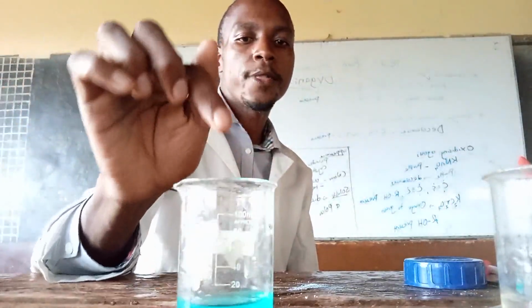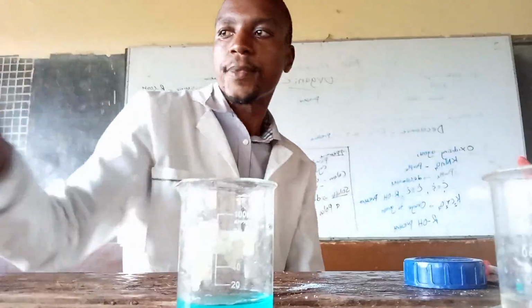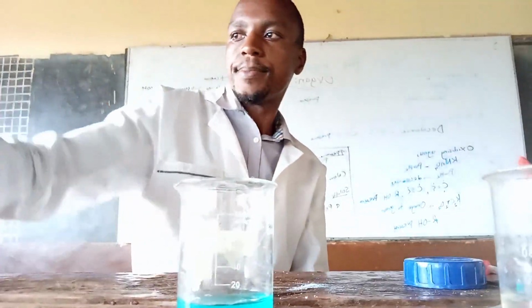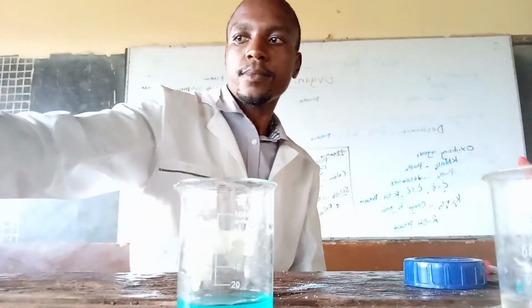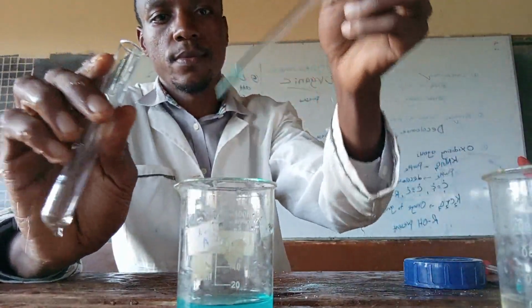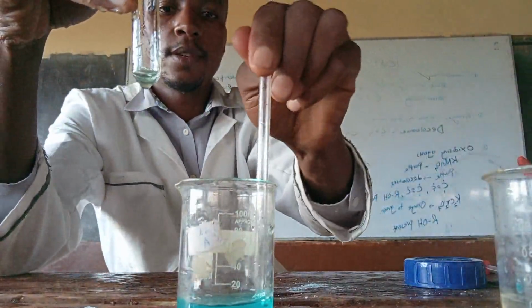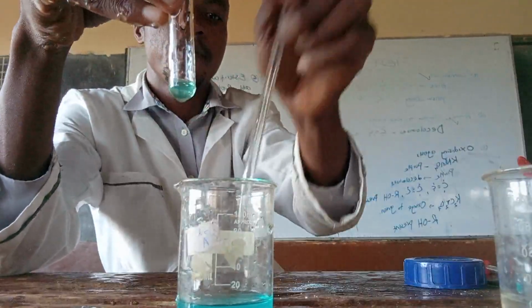Now, how will this behave when we add sodium hydroxide in there? Let's see. So this is my copper ion. I already know it's copper because of the color.